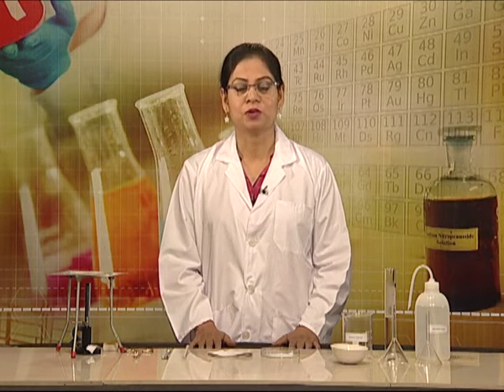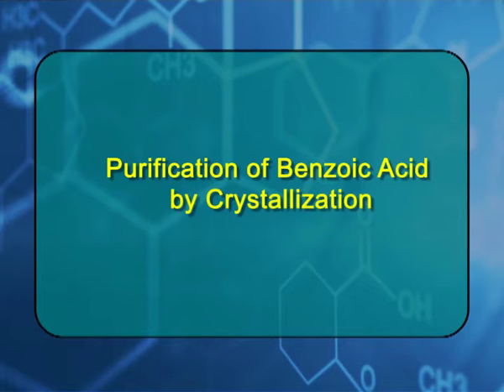Today, I will demonstrate one of the most commonly used techniques for the purification of an organic compound, and that is crystallization. The aim of the experiment is purification of a sample of benzoic acid by crystallization.